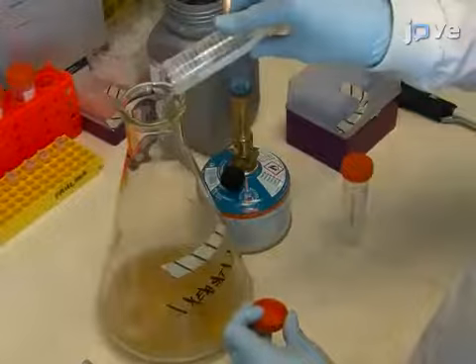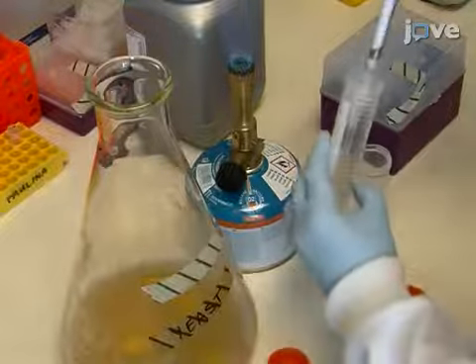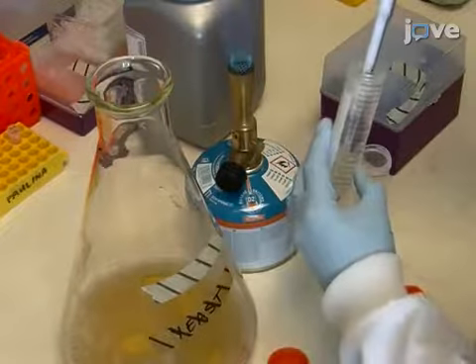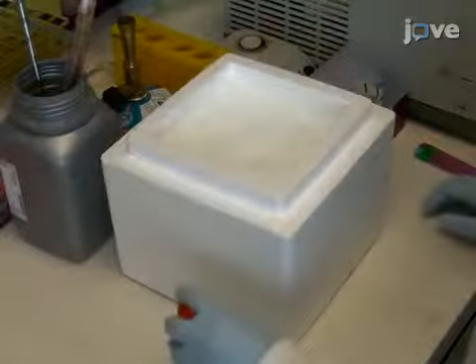After discarding the supernatant, resuspend the yeast pellet in 1 milliliter of freshly prepared sterile 1X lithium acetate and TE. The competent yeast cells must be used within 1 hour of preparation.